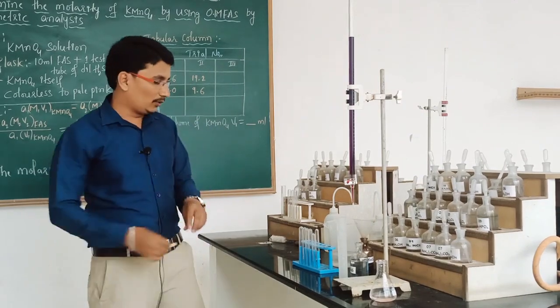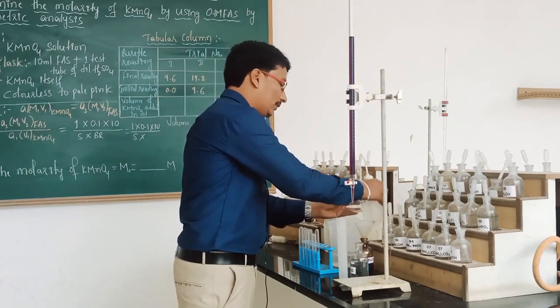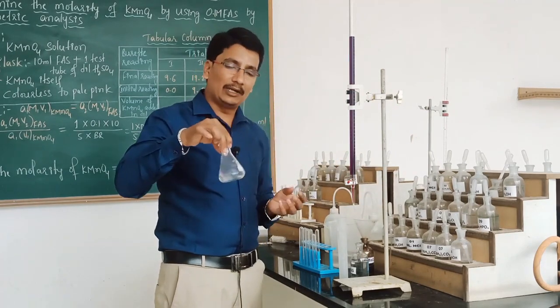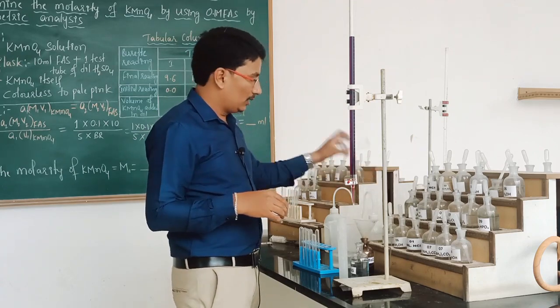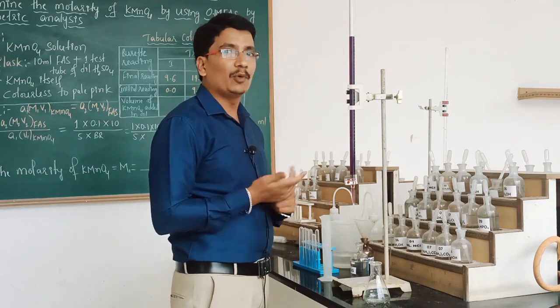Therefore, we have to take one more trial. Same procedure. We have to wash the conical flask by using water. ನೋಡಿ conical flask ಗೆ ನಿಮಗೆ 1-2 ಡ್ರಾಪ್ ನಮಗೆ ಅಟ್ಲೀಸ್ಟ್ ಕಲರ್ ಸೊಲ್ಯೂಷನ್ ಕಂಪ್ಲೀಟ್ ಹೋಗ್ಬೇಕಪ್ಪ ಅಂದ್ರೆ ನೀಟಾಗಿ ವಾಟರ್ ಇಂದ ವಾಶ್ ಮಾಡ್ಕೋಬೇಕು. ಅಗೇನ್ ವಾಶ್ ಆದ್ಮೇಲೆ ನಮಗೆ 10 ml FAS ಅನ್ನು ತಗೋಬೇಕು. ಅದಕ್ಕಿಂತ ಮುಂಚಿತವಾಗಿ ಇನಿಷಿಯಲ್ ರೀಡಿಂಗ್ ಅನ್ನು ರಿಪೋರ್ಟ್ ಮಾಡ್ಕೋಬೇಕು.